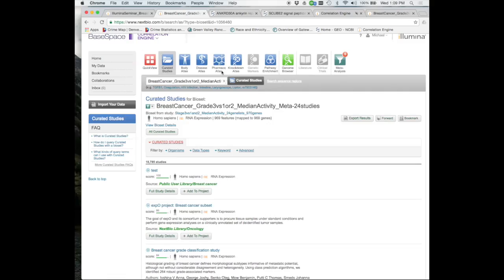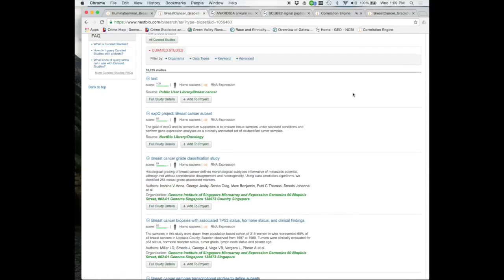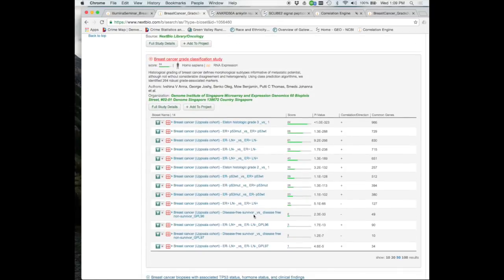So what it's doing is pulling out data sets that I didn't use in the original one. Maybe I use this data set next time and combine it into the analysis. So you're almost using this stuff like bait, right? I got my bait, I got a really kick butt breast cancer gene list, I throw it in there, and now I'm fishing out other things that are similar to it.